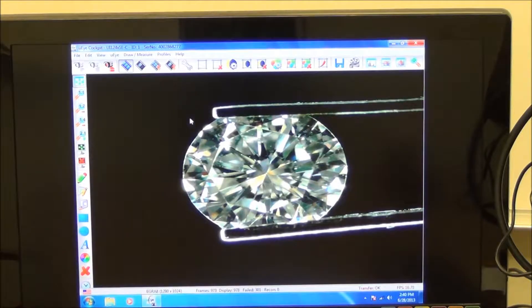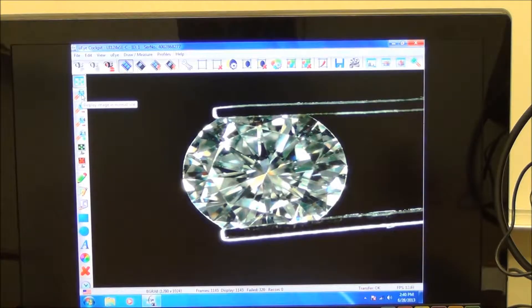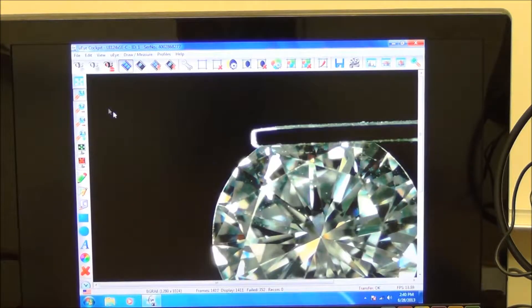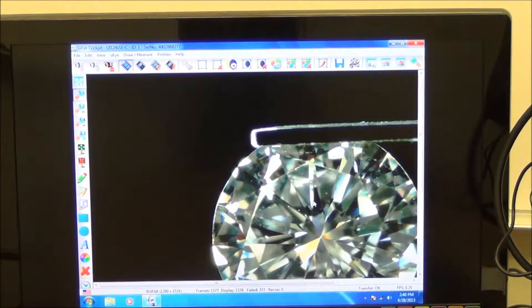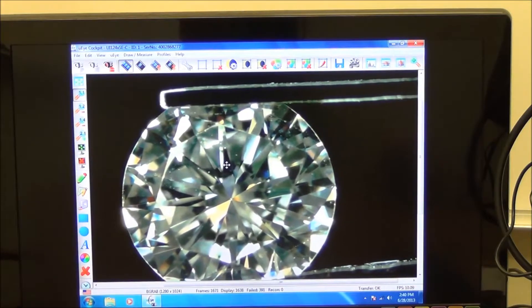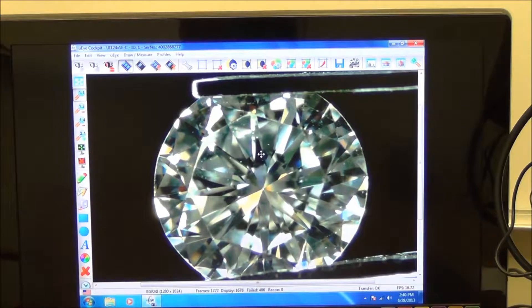Once the parameters are loaded, you may want the diamond to appear more round. On the left side of the screen there's a toolbar with a magnifying glass that allows different aspect ratios. Click the one-to-one ratio to display the image in its normal size, and you'll see the diamond as it actually is. To move the diamond on screen, left-click and hold with your mouse and drag to reposition it.